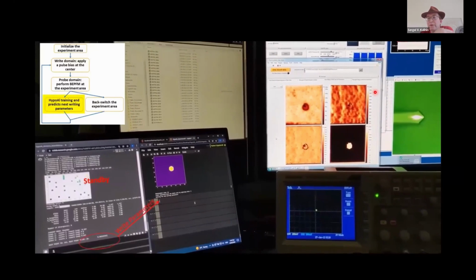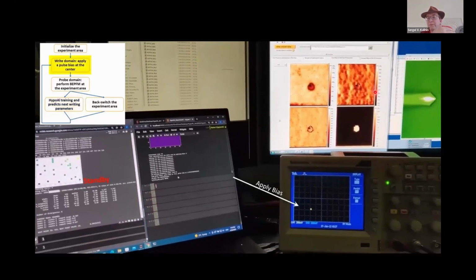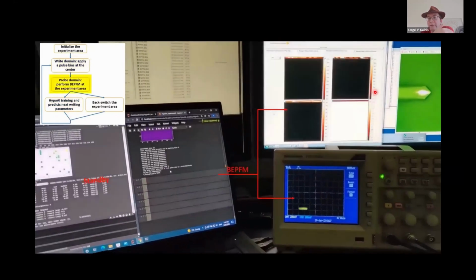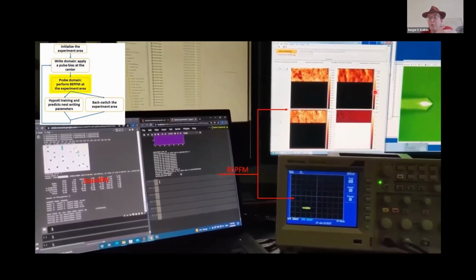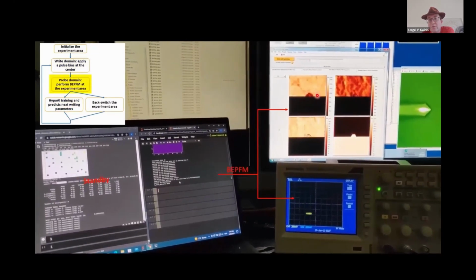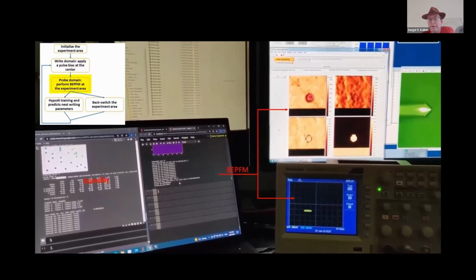So the reward function in this case is the predictive uncertainty. We intuitively expect that if the hypothesis is right, then it describes the experiment better. So in order to make a policy for the automated experimentation, we allow the hypothesis that gives the better predictive power to run the experiment more often. And what you see on the screen here is an example of the work done while I was still at Oxford about 4 years ago, where our probe creates a domain.